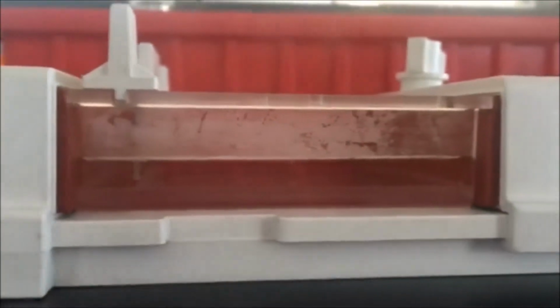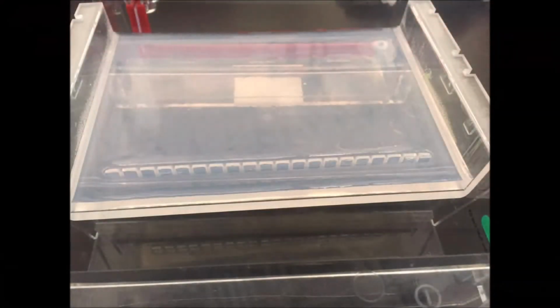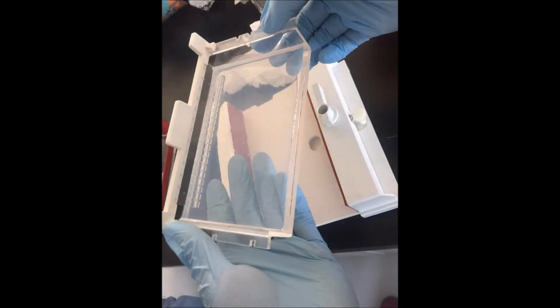When it is boiling, the fluorescent dye is added at 0.3x concentration, taken from a 10,000x stock solution, before the gel becomes viscous. Once it is poured into the chamber and left to set, the DNA samples are put on ice in order to be used later.